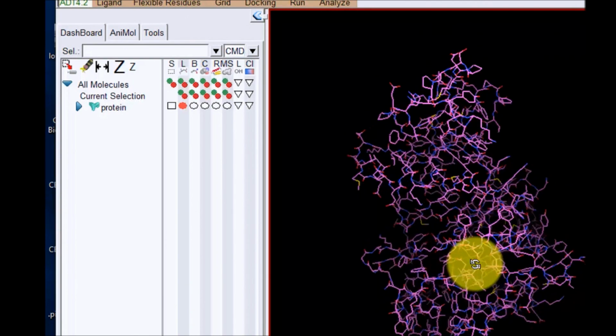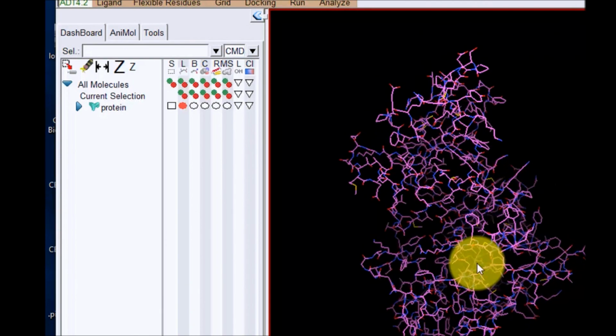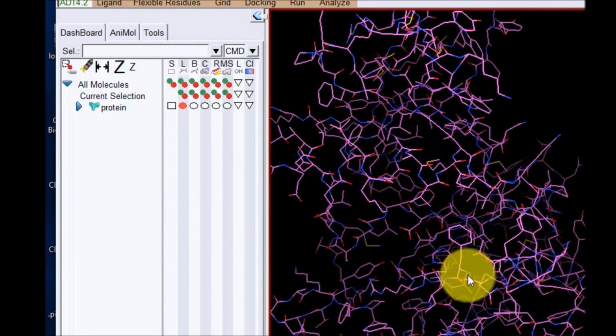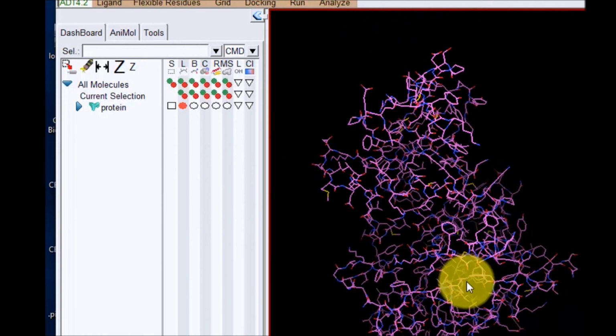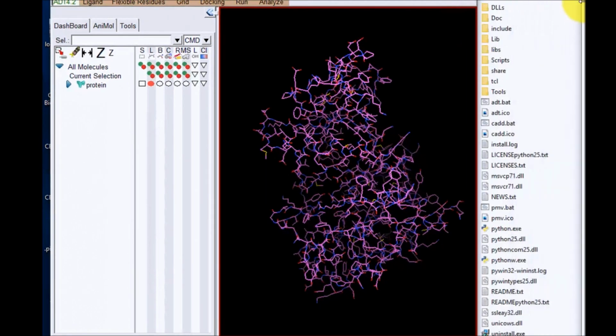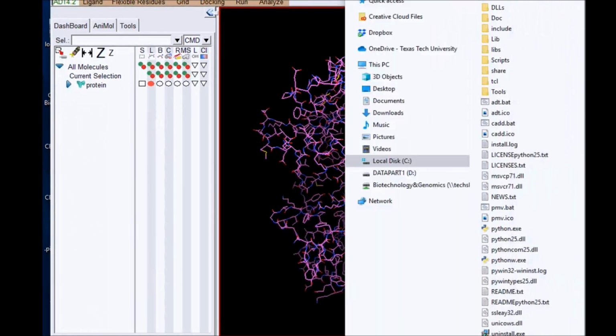You can use the left click to rotate, and I think the middle button, the middle wheel, to zoom in and out. So you can see how this works, right? One of the things we can also do in this case is maybe make this a little smaller.